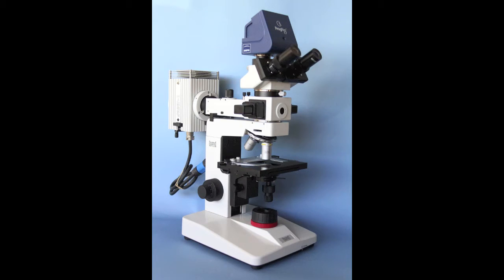You might say, well Mark, all rocks will autofluoresce with structure that might look like plant tissue under a fluorescent microscope. Well, that's not necessarily true. Here's a piece of mica. It is autofluorescing, but it does not have the kind of structure that we saw in the petrified wood. Here's a piece of coral. Again, no cellular structure. It is autofluorescing, as is this piece of granite, but no cellular structure.